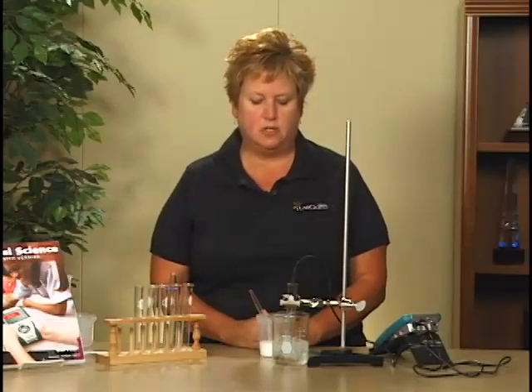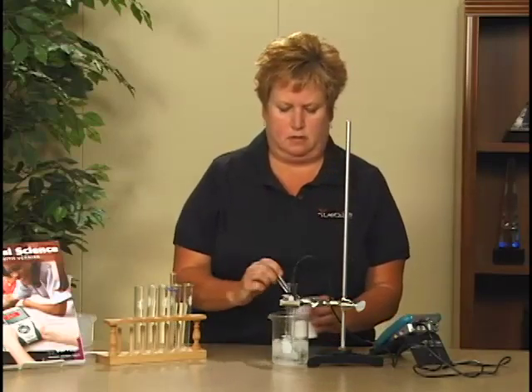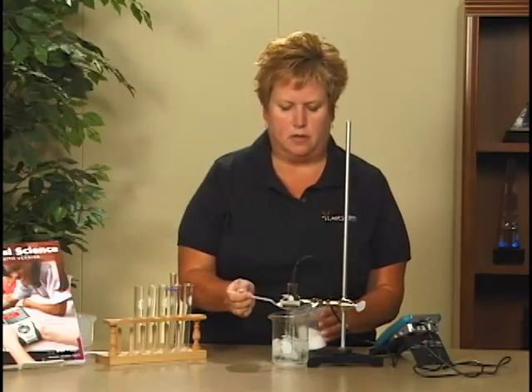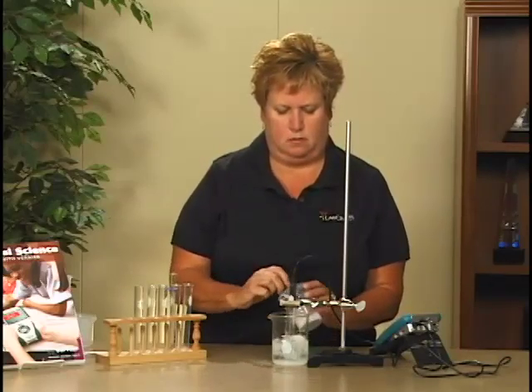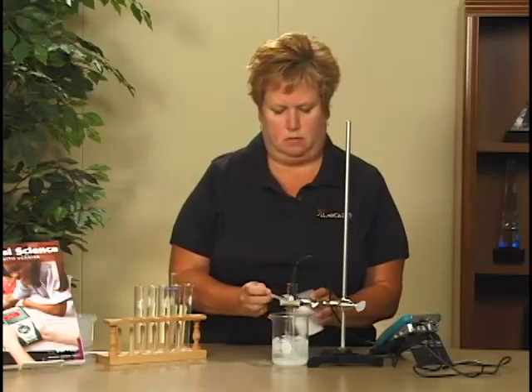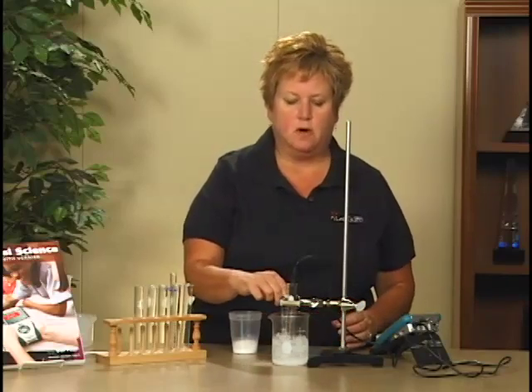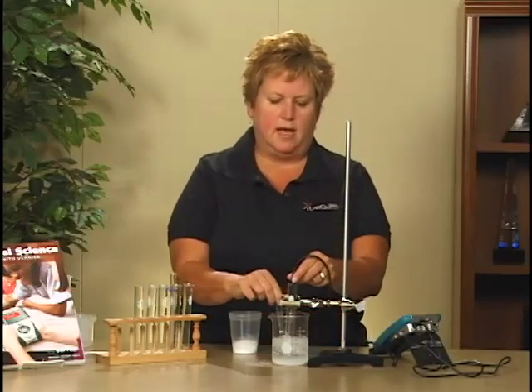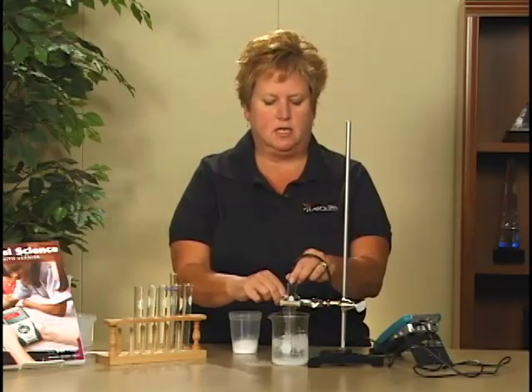After data have been collected for 30 seconds, you will be adding 5 teaspoons full of salt to the water. Add the salt to the water in the beaker, and start stirring the water in the beaker. At the same time, gently move the temperature probe in the test tube.